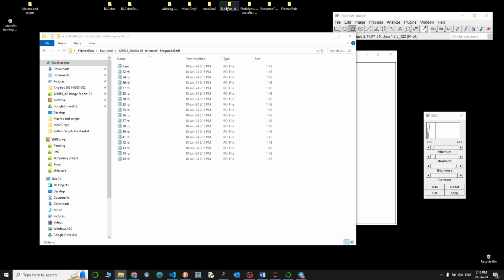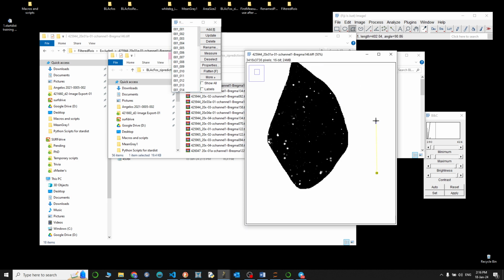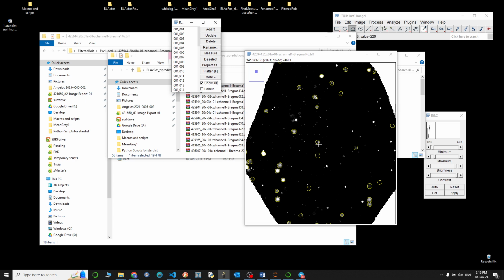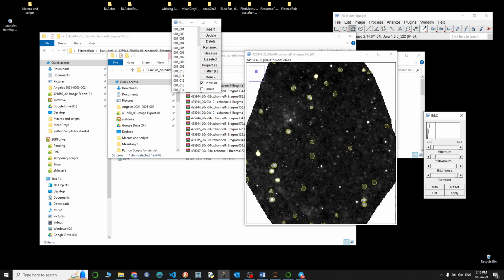So what I will do first is that I will find the primary predictions, the unprocessed predictions of StarDist, and these are all okay. So as you can see, we have some predictions in regions that are less bright, let's say. Why? Because if we make this even more bright, then something will start appearing there.